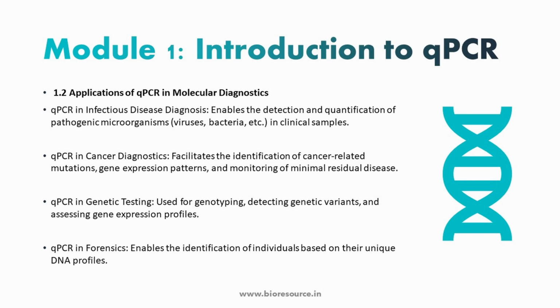And we can also use this for cancer diagnostics to monitor certain mutations and also to identify gene expression patterns and monitor minimal residual disease, meaning that during the cancer phase, if you are giving a therapy or a drug to treat that mutation, the amount of disease that is present can be monitored by monitoring the gene expression levels. So when you give a medicine to a patient, the levels of certain proteins and the RNAs change, so RNA tends to release proteins.